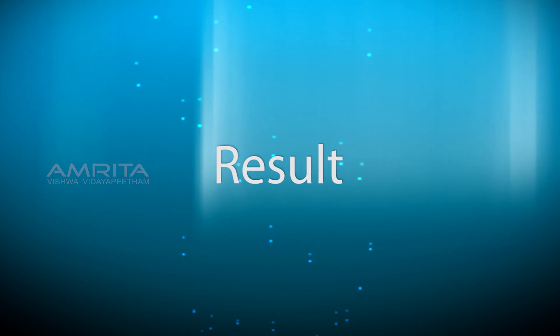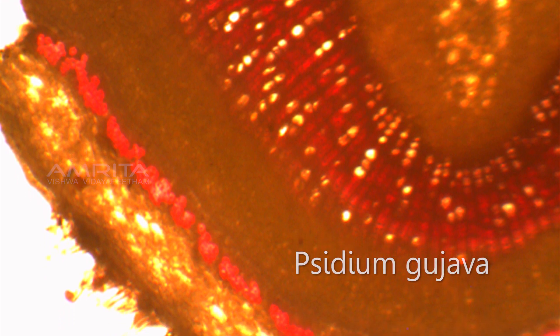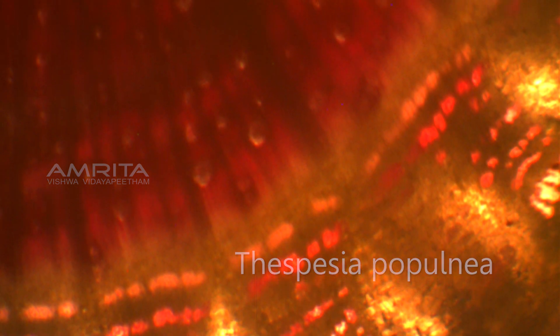Result. The red colour seen in the sections indicates lignin staining. Lignin staining is heavy in both xylem cells and interfascular fibres.